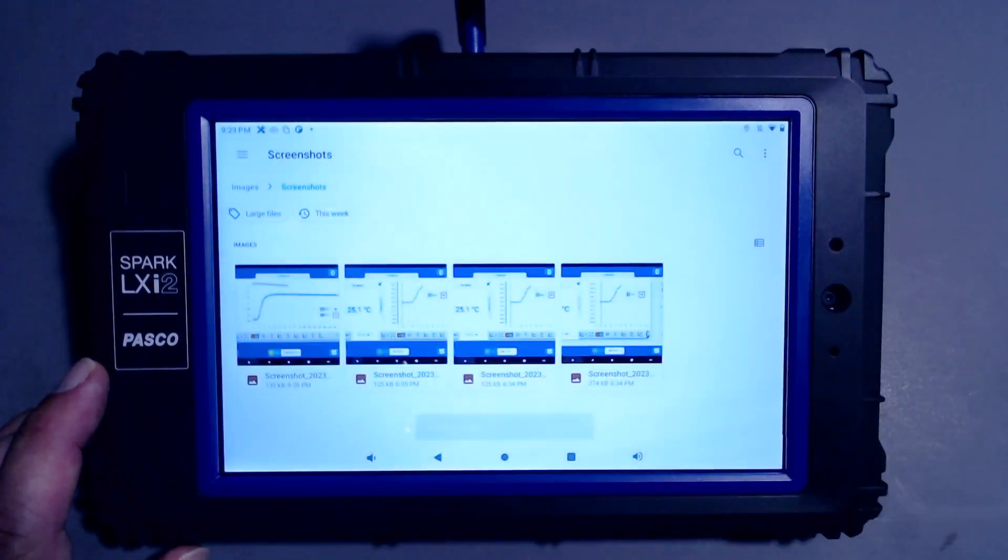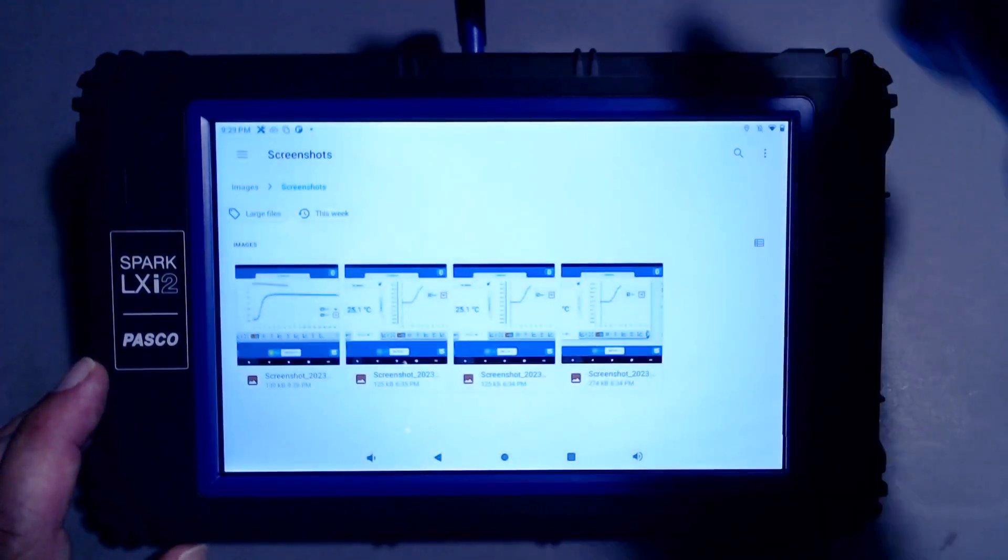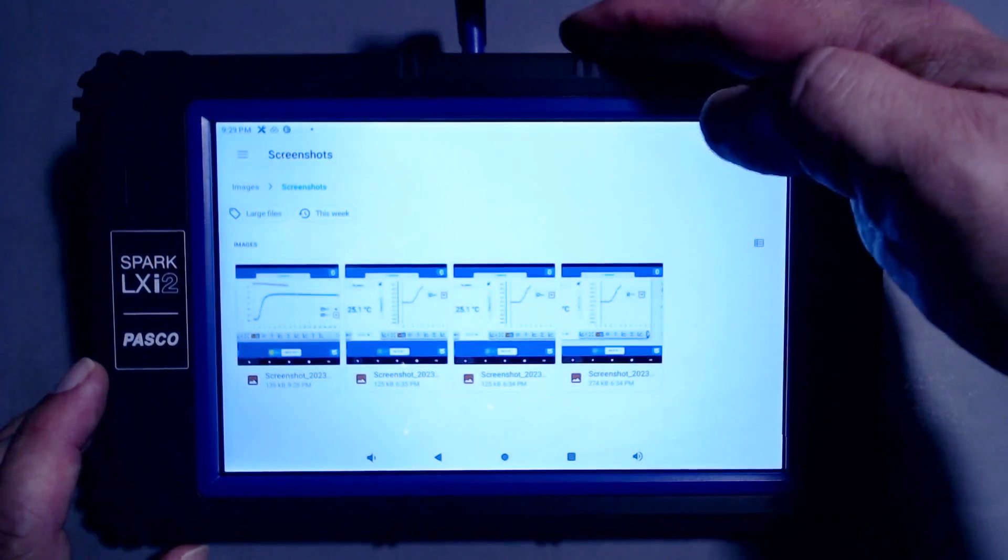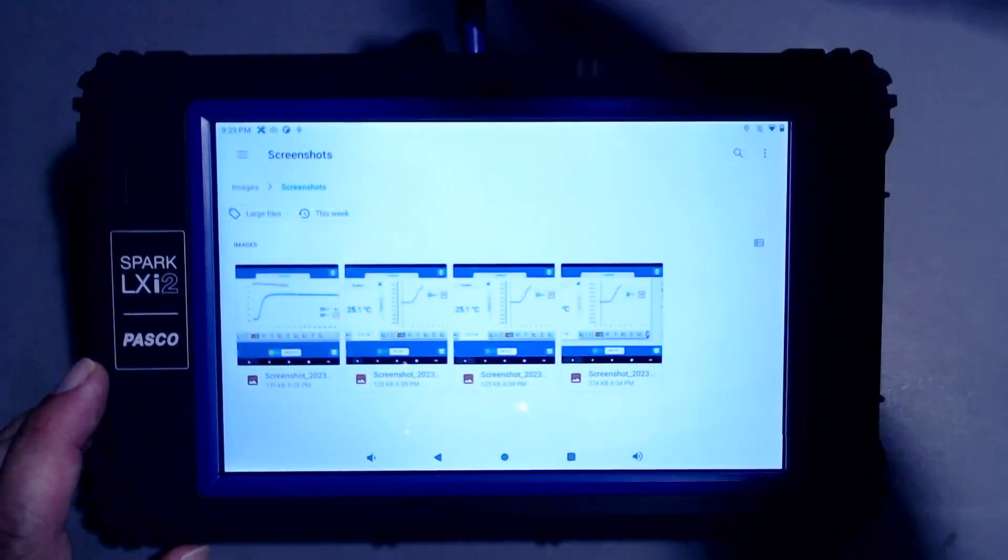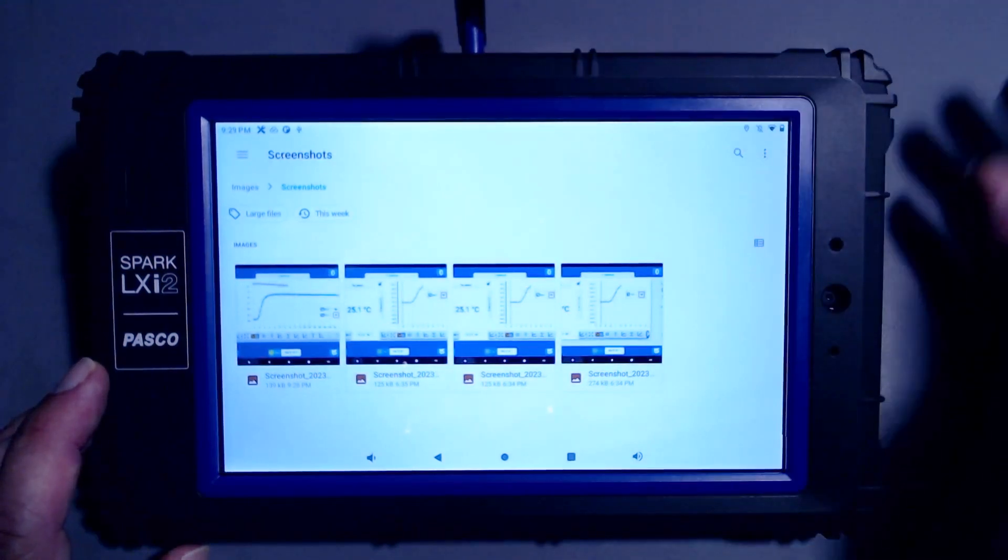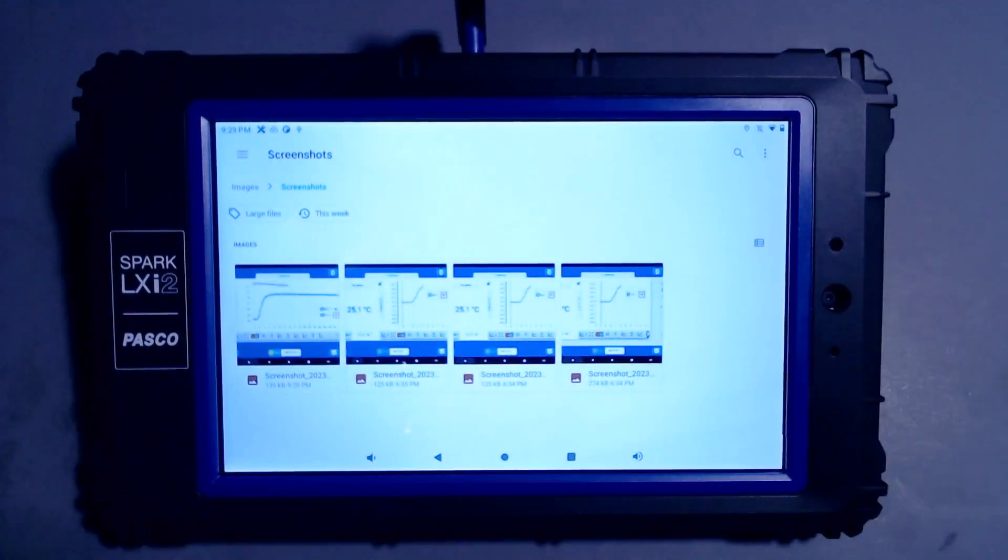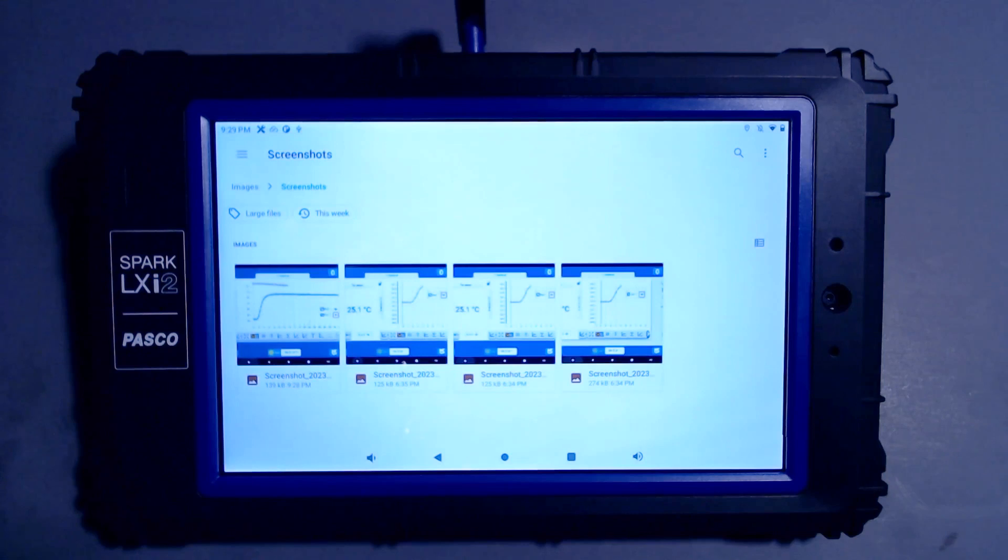That image is now on my USB flash drive. I can pull that USB flash drive out and bring it to a computing device, and import that image into something like Microsoft Word or Google Docs to write my report.